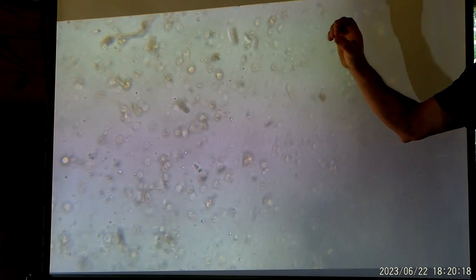Okay. I will say, going back to the symmetry, that big crystalline structure that looked like a testate was not quite as symmetrical. The testate amoeba are oval, but there's still some symmetry there. Most of the microbes that we're looking for have a level of symmetry. Even the filamentous organisms are going to be consistent in the width, whereas a root hair will get fragmented and taper down and get big.